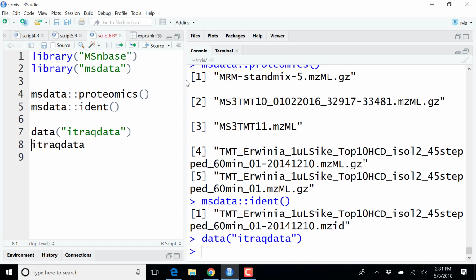Are you familiar with the mzTab format? Anyone? So I won't spend too much time on this format. It's a kind of tab-delimited format for quantitative proteomics or metabolomics data. But it's somehow surprisingly not yet well established. So raw data, identification data, and quantitative data.